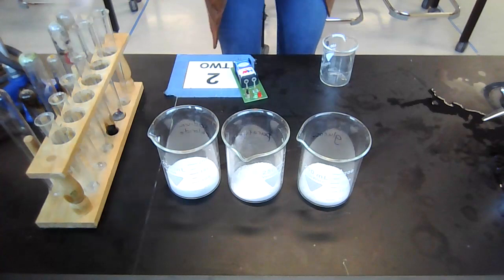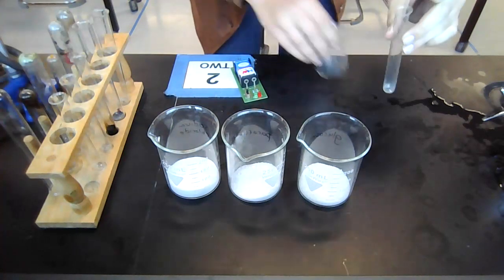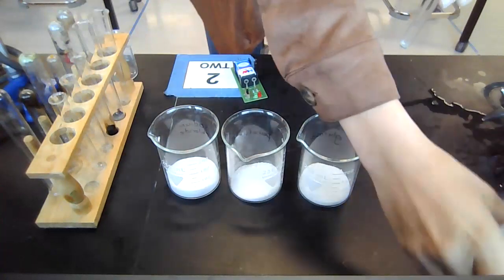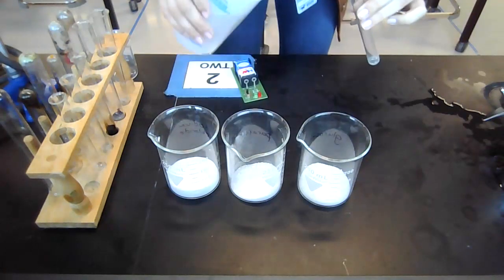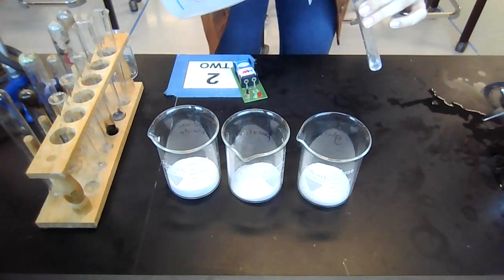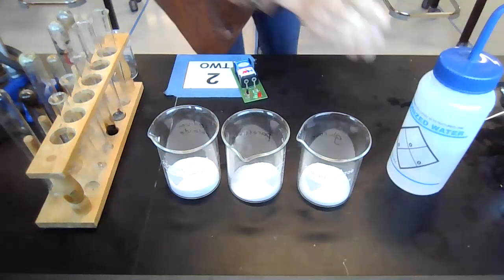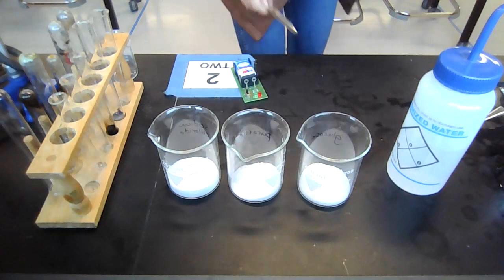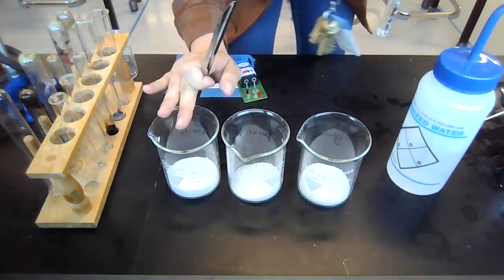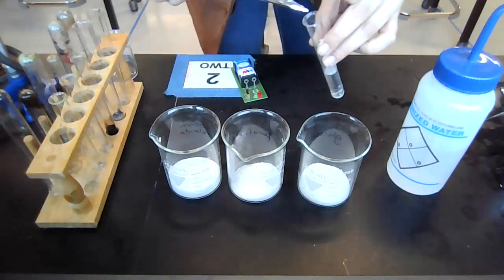First thing we're going to do is see if they can dissolve in water, see if they're soluble. Because I want to use these for the next test, I want to make sure that I use the deionized water. So I'm just going to add some water into a test tube. Then I'm going to start off with sodium chloride here. I simply want to see if this dissolves.